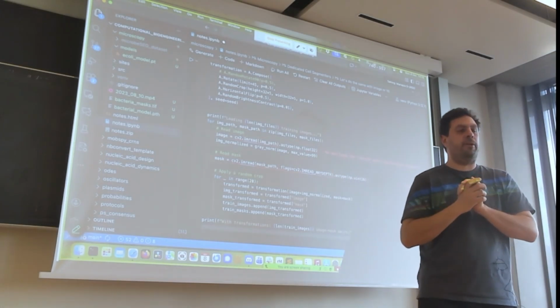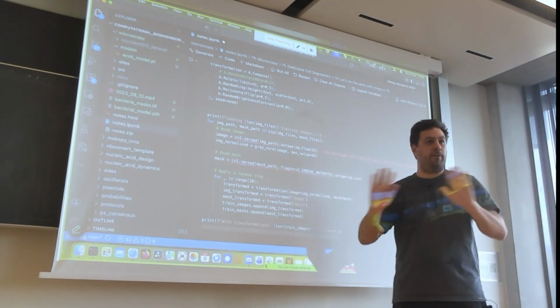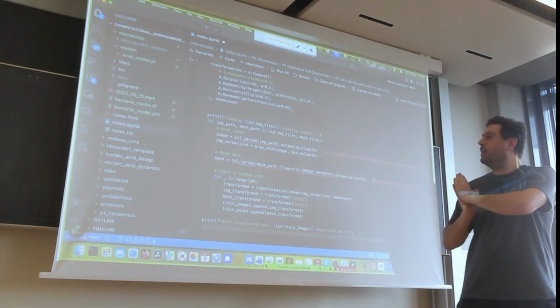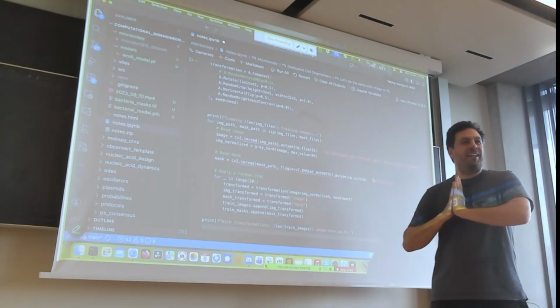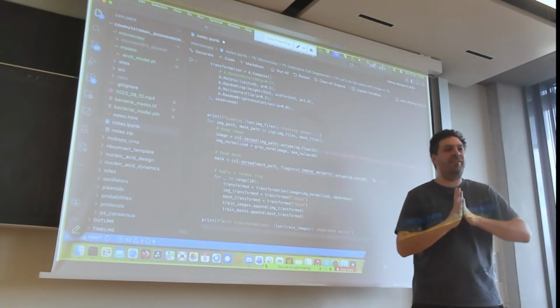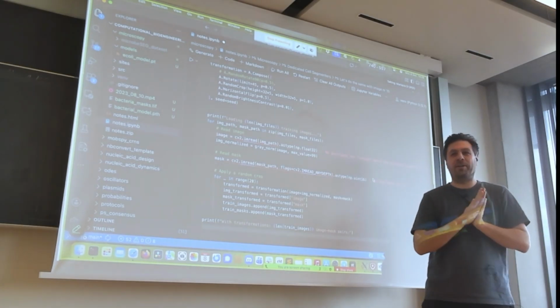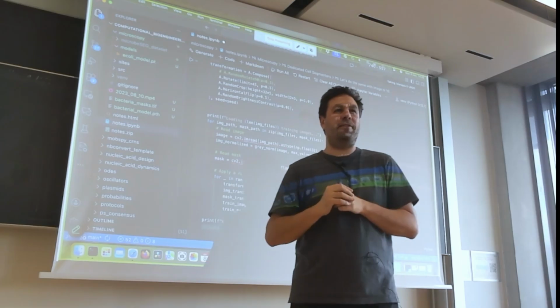We have, I think, a 1 hour video of such E. coli flowing around, so we have tons of images. The problem is we don't have many manually segmented images. Because why should we? So what we did for you is we hand segmented 2 images. But already 2 images takes a bit of time.